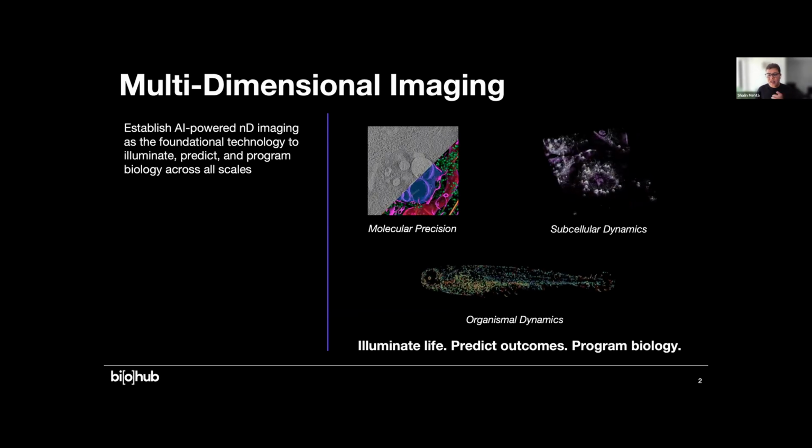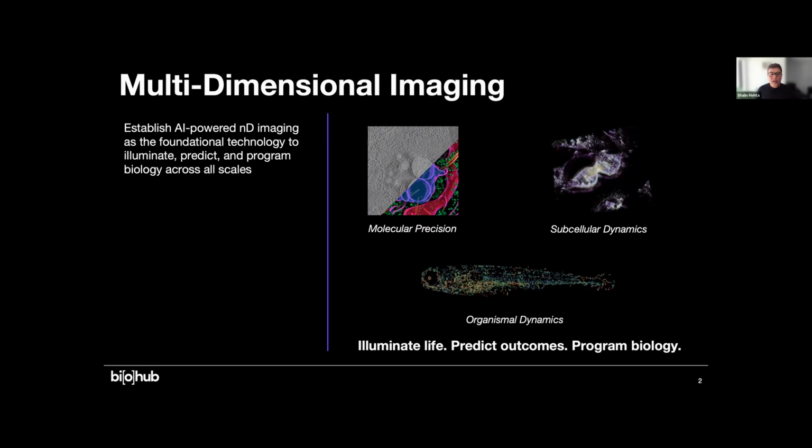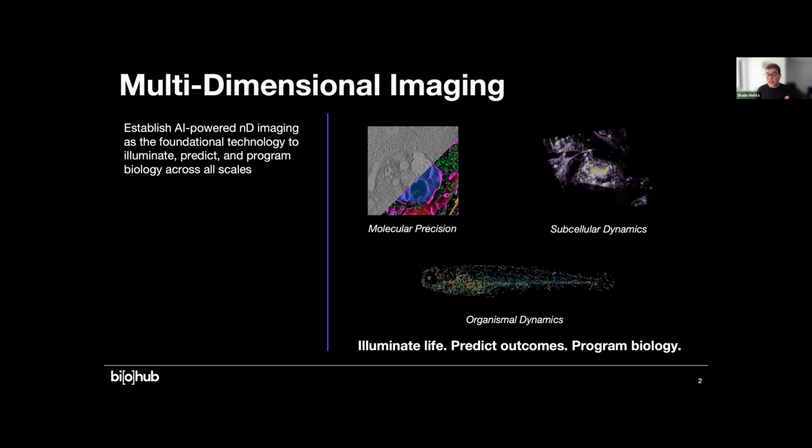It's Imaging Grand Challenge. And the focus of the whole organization now is to pursue team science and to drive towards new methods for n-dimensional imaging across different biological scales. The Redwood Shore site focuses on using electrons to look at molecular complexes.